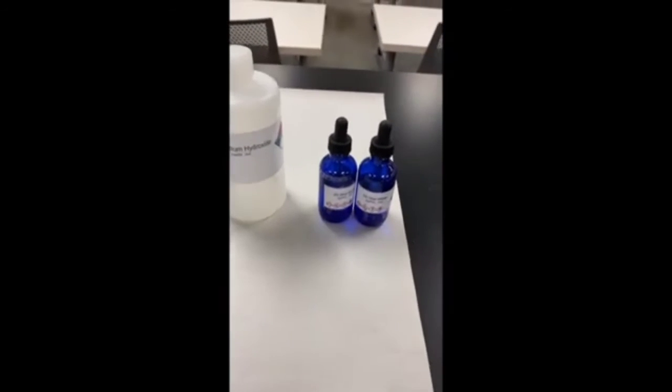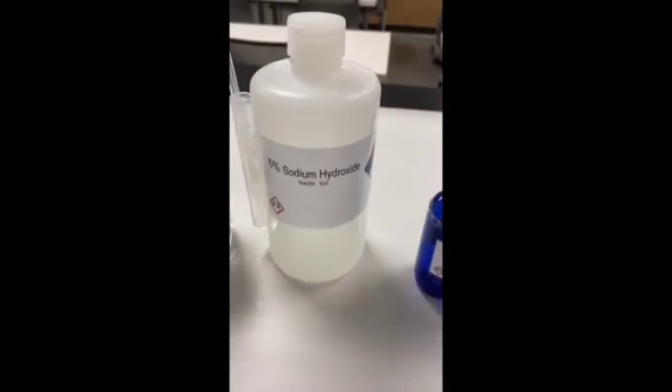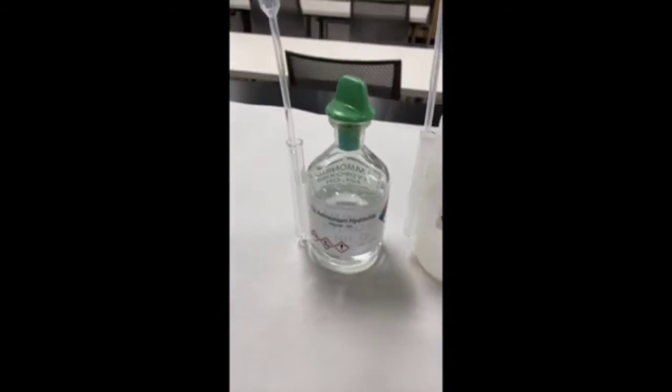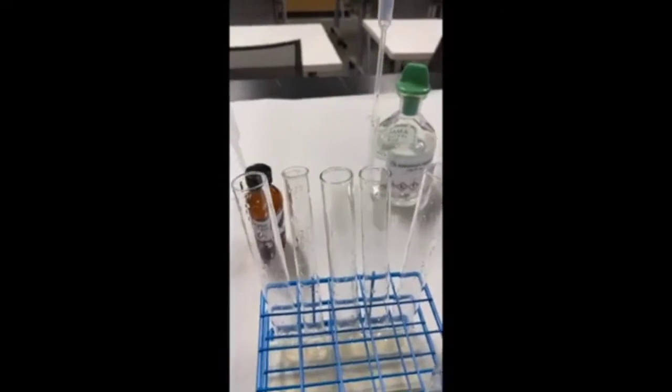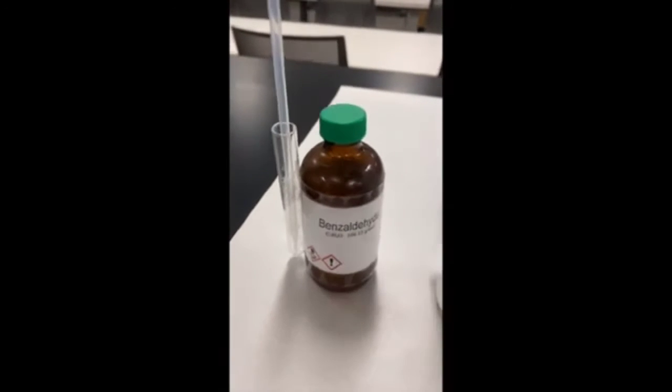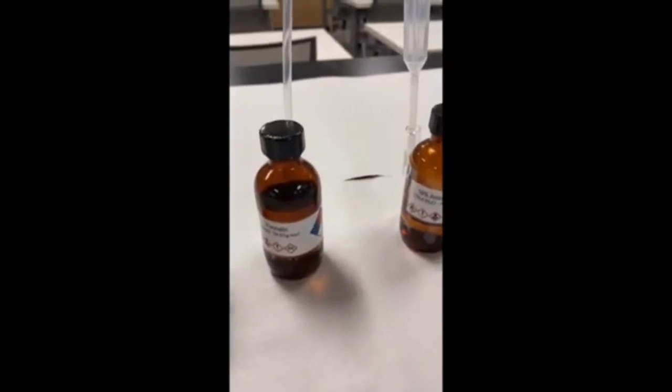The first thing I'm going to do is make the Tollens reagent using silver nitrate, sodium hydroxide, then ammonium hydroxide. I'm going to take that solution once I make it, following the directions, and disperse it into 5 test tubes equally. To the first test tube, I'm going to add benzaldehyde, second acetone, third 3-pentanone, fourth formalin, and the last one acetaldehyde.